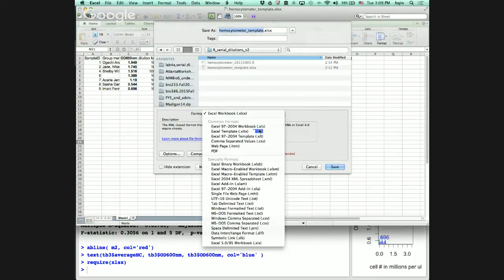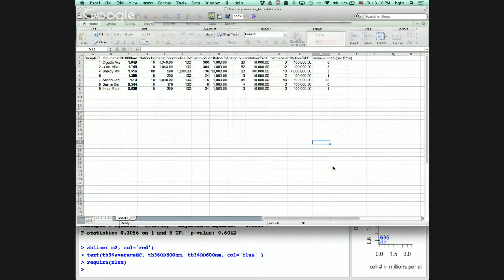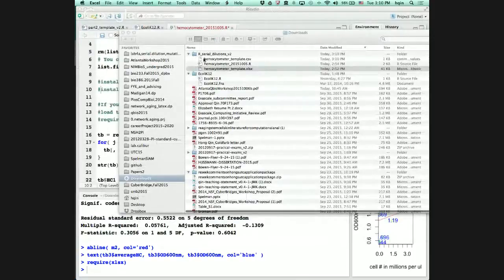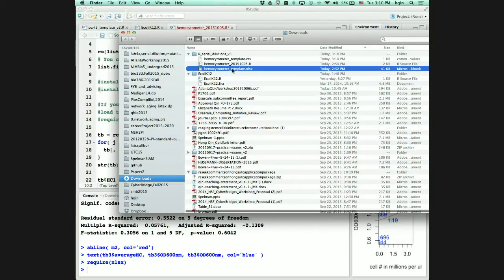I'm going to update it again, because some of your computers somehow just quit for some reason. I don't understand. Okay, so I'm going to change this to version 3.